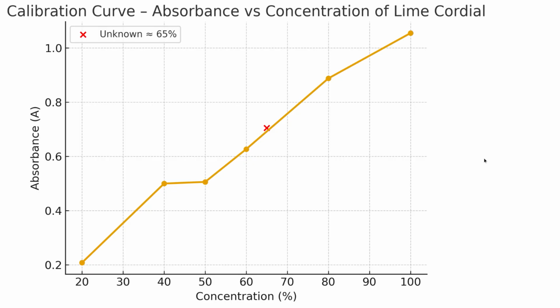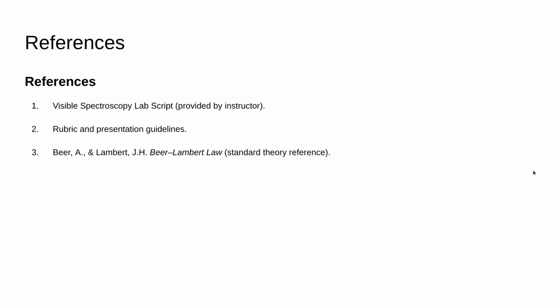Like 40 and 50%, again, the results were quite similar, but there's nothing to worry about, because we can see that it does go up slightly at 50%, and then it carries on going up in a steady and steep slope. So I was quite happy with these results.